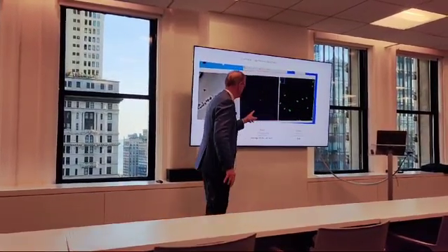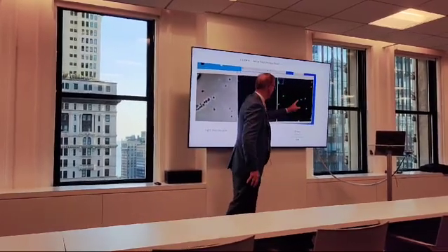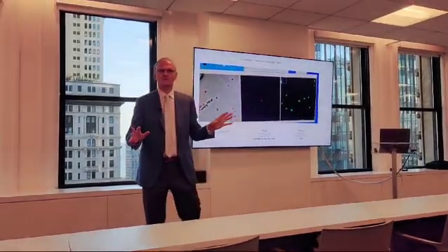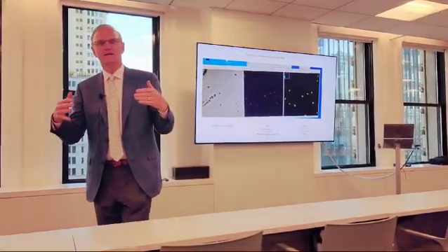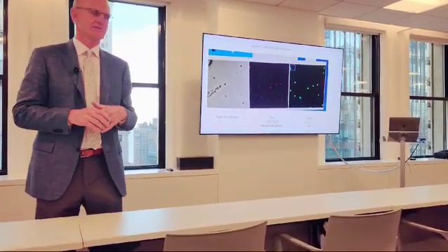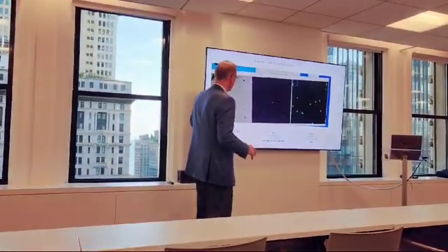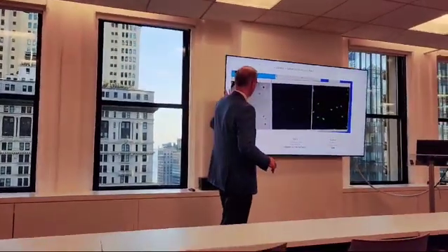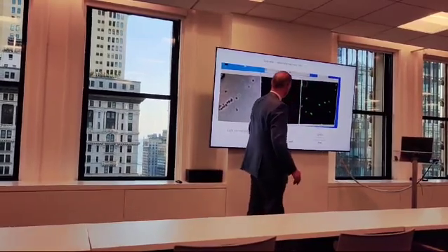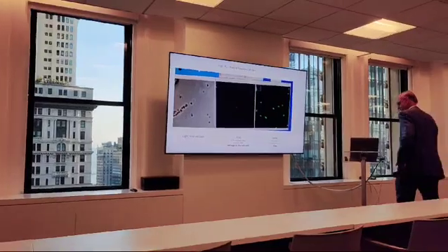And then look at how these line up. See that? Little cup, and then the three. So this is the first time we've ever demonstrated in sort of live theater this bactericidal effect. Let me just show you it one more time, okay? So this is 30 seconds long. These bacteria are just floating around, they get fixed, and then they get pierced and the wall dissolves. And let's take a look at that one more time.